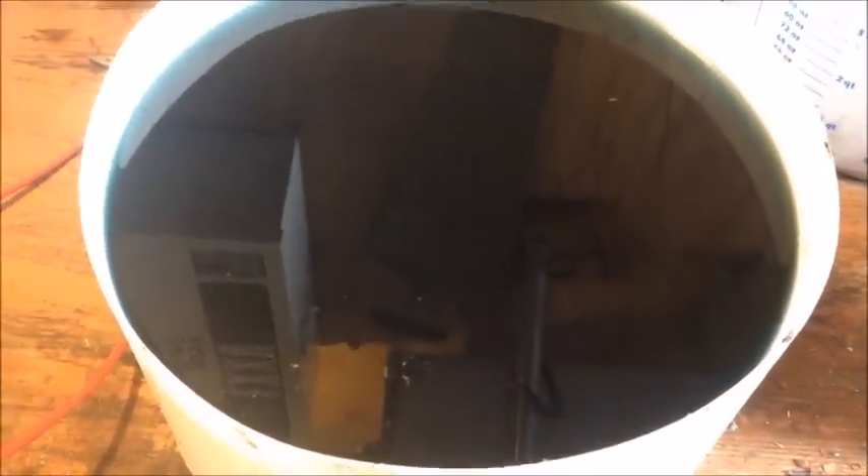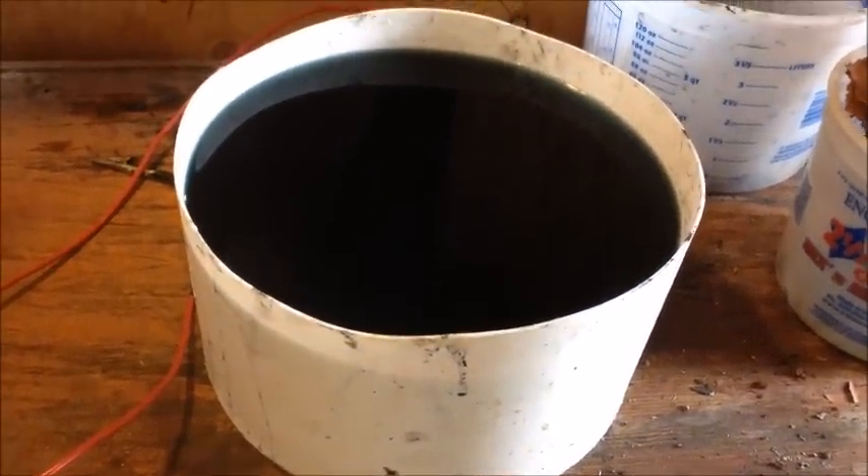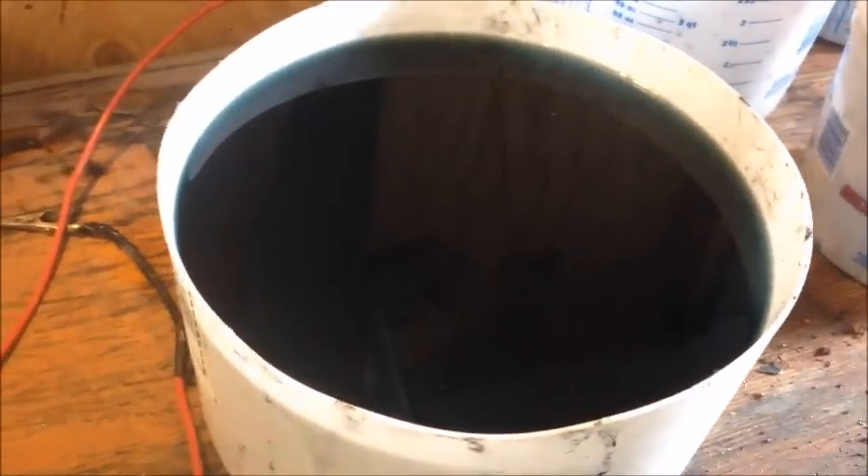Here is our plating solution — it's gotten quite dark due to impurities that came off the copper anode. There's a bunch of black sludge in the bottom, and that's the anode slimes where all of our precious metals are going to be.